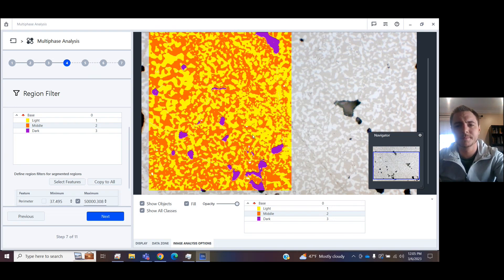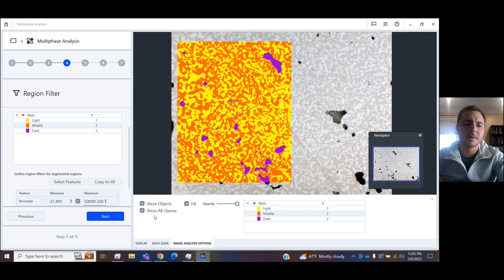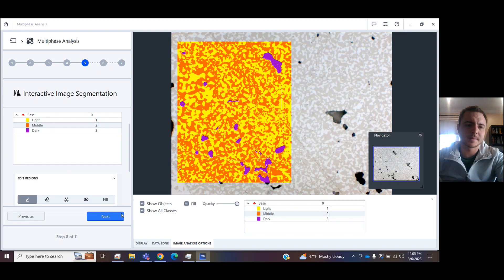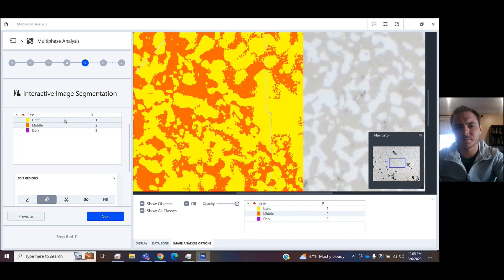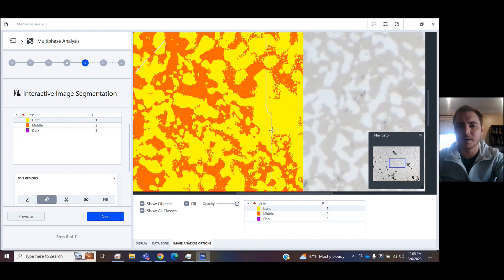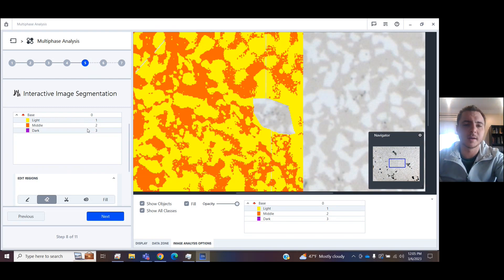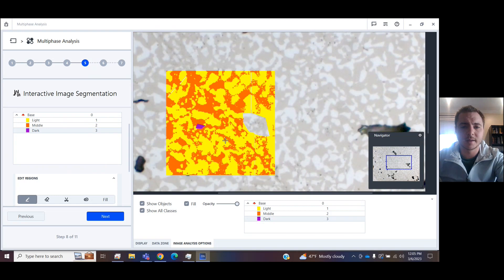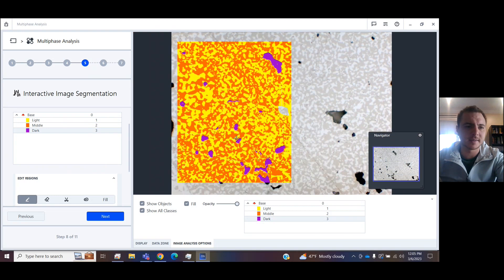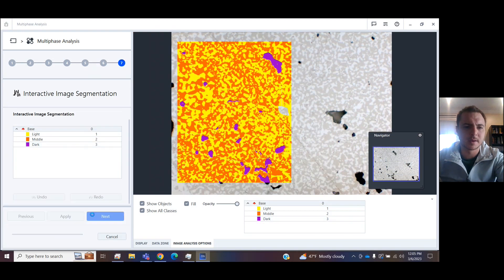Finally, you have interactive segmentation. So I can come in here, I can say, I don't like what's going on in here, let's remove it from the middle class or even from the light class. Now there's nothing being counted there. You could reassign something, say it's dark. For whatever reason, you just have a chance to manually add and subtract in this fifth step.